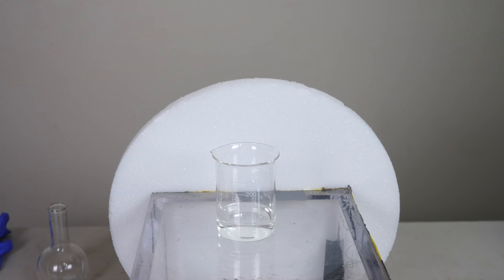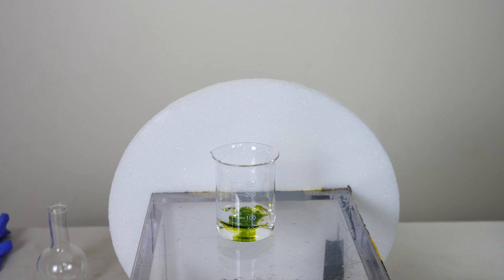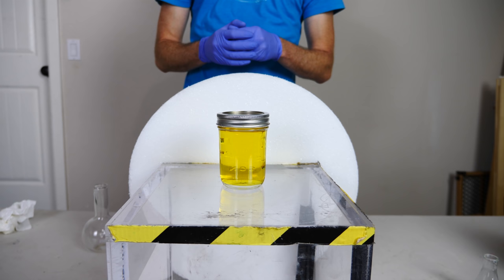Now indigo carmin is a redox indicator. But it can also be used to make a really cool color experiment like this. When indigo carmin is fully oxidized, it's going to be green. But when it's fully reduced, it's going to be yellow. And then there's an intermediate stage where it's going to be red.